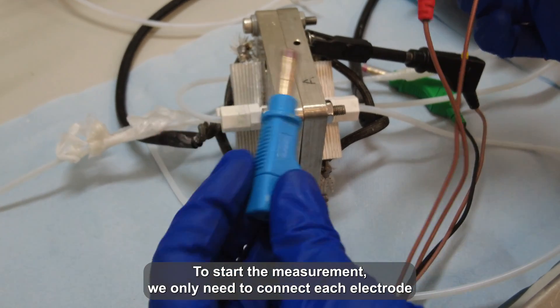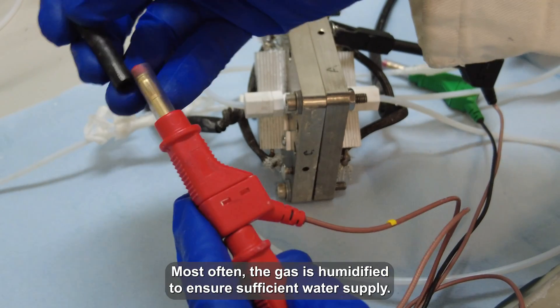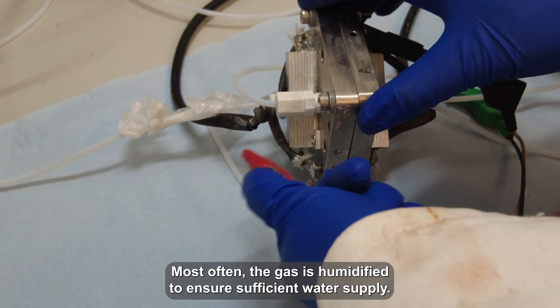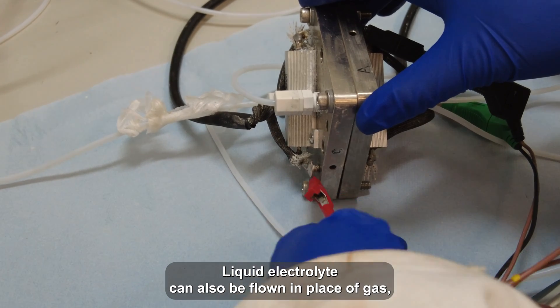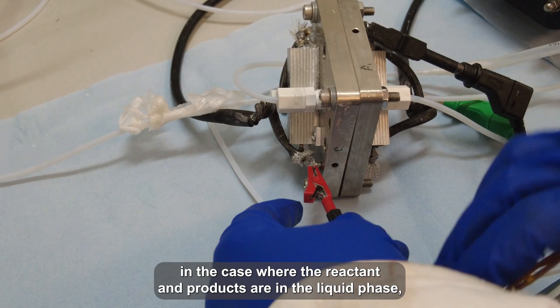To start a measurement, we now only need to connect each electrode to the correct lead and start the flow at the external chamber. Most often, the gas is humidified to ensure sufficient water supply. Liquid electrolyte can also be flown in place of gas, in the case where the reactant and products are in the liquid phase.